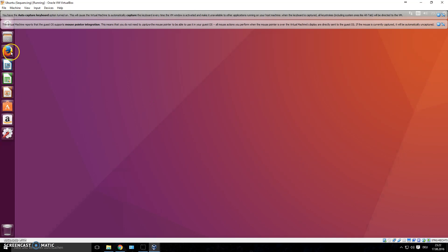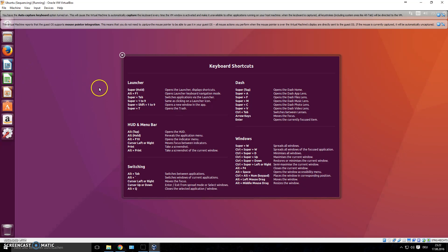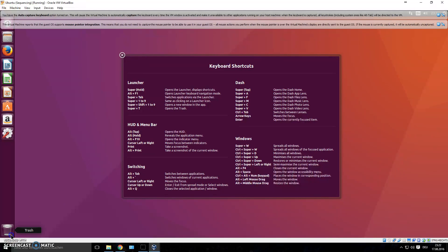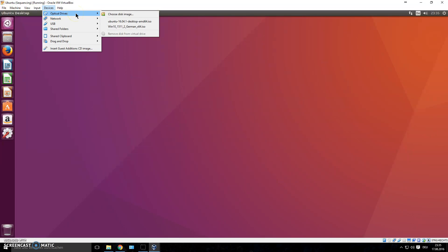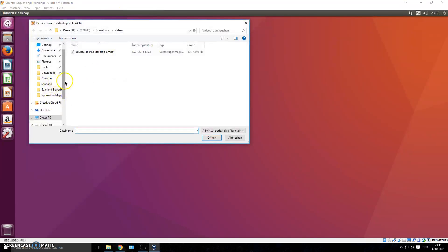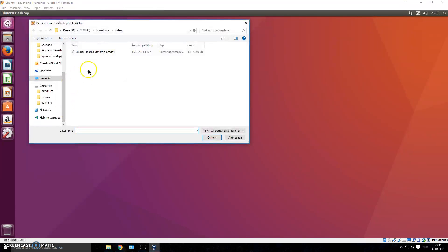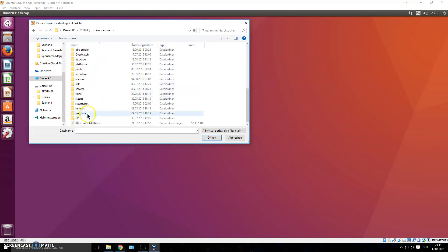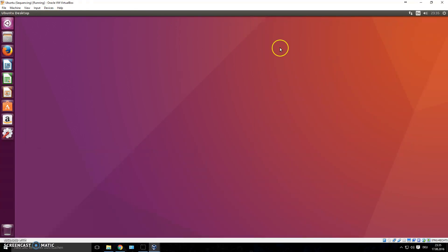If the resolution is too small even in full screen, there's a fix. Go to Devices > Optical Drives > Choose Disk Image, navigate to your VirtualBox installation folder, and find the file called VBox Guest Additions. Install that — I recommend watching a separate tutorial for this step, just Google it. It will fix your resolution. The main thing we'll work with is this Ubuntu operating system and the terminal.